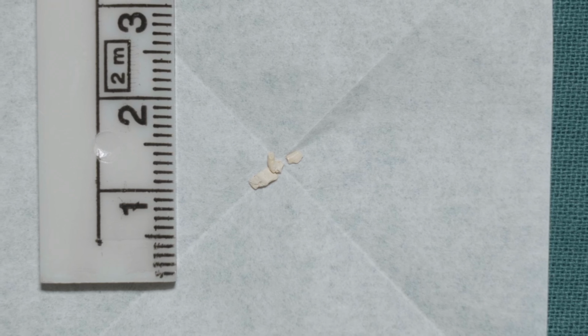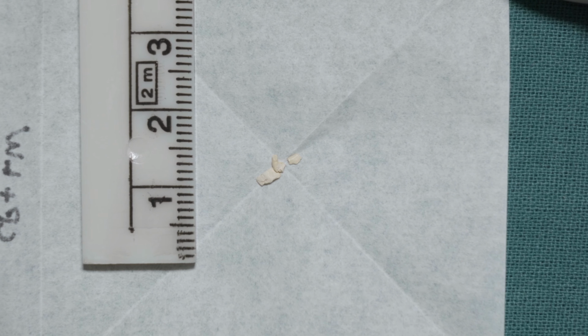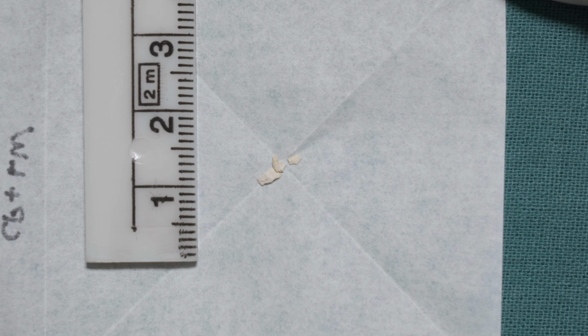The last but crucial step was the application of the database to real cases. I got the opportunity to investigate a Roman wall painting from the Netherlands, where there was the suspicion of the presence of lead calcium phosphates. So, I got the chance to analyze them with infrared and Raman spectroscopy, and after that, applying my database, I recognized the presence of lead calcium phosphates, more specifically a compound with a percentage of lead between 70 and 80%.